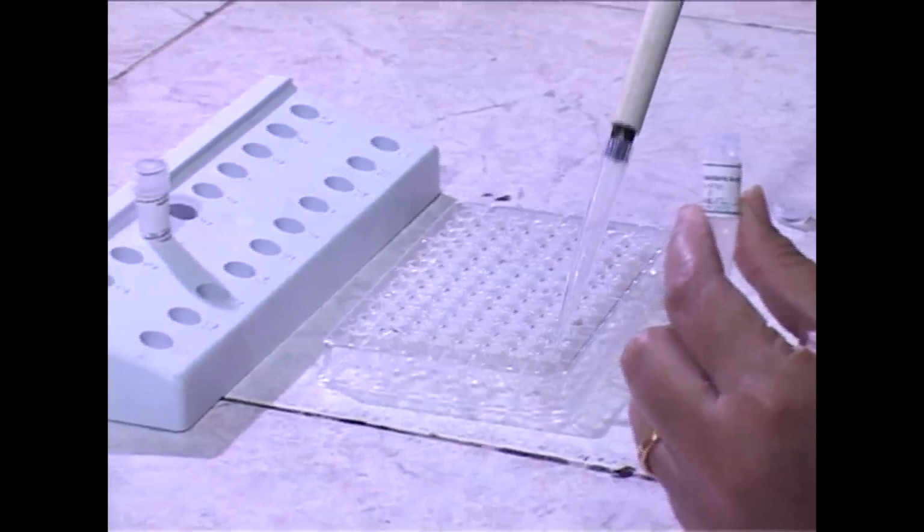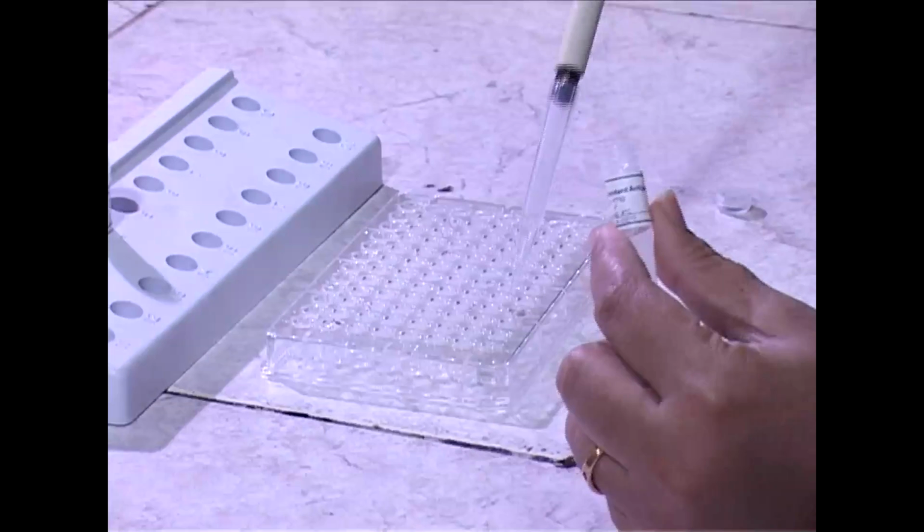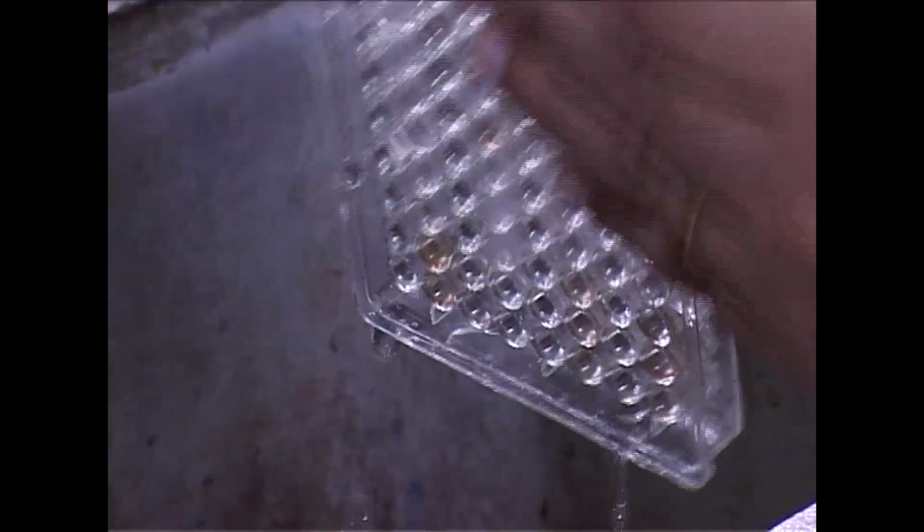Indirect ELISA is a two-step process. Two antibodies are used here. One is the primary antibody and the second one is a labeled secondary antibody. Now how can we perform indirect ELISA? First we have to add the antigen in a microtiter plate. Then we have to wash the wells properly to eliminate all the excess antigen.